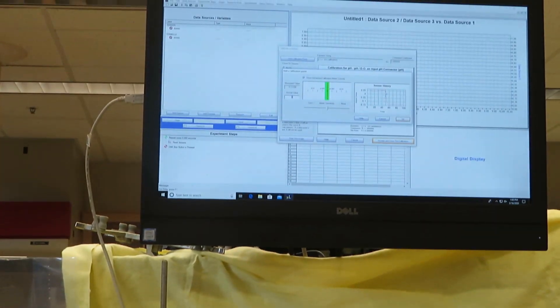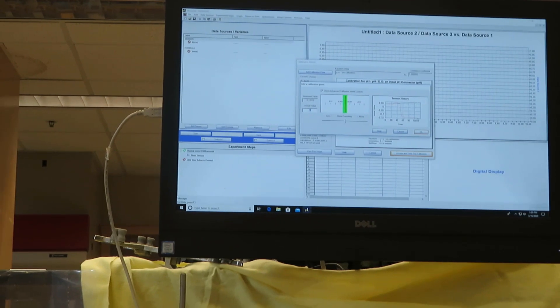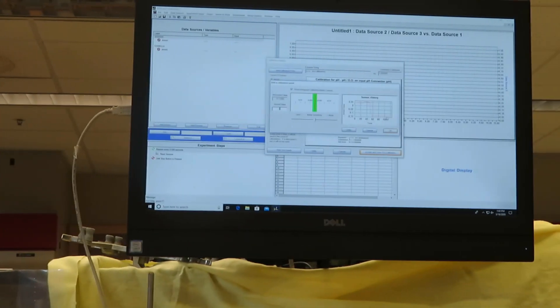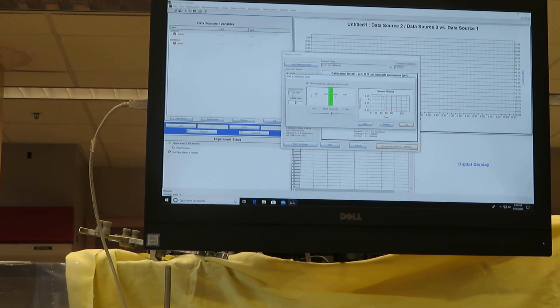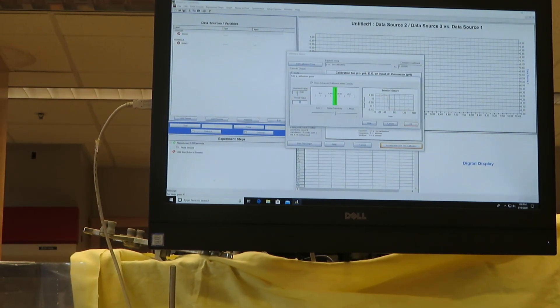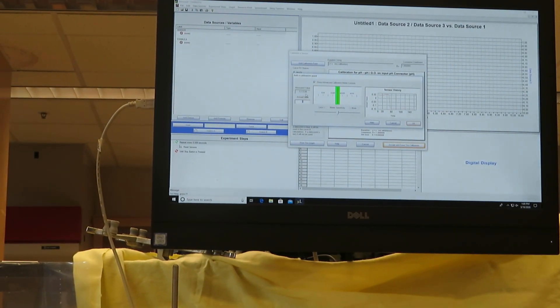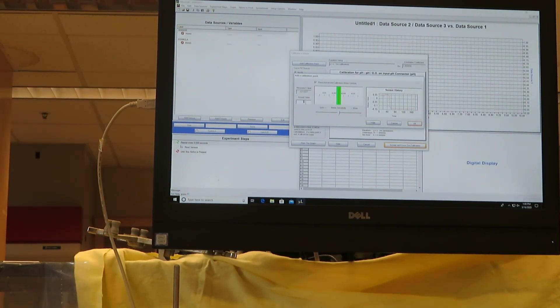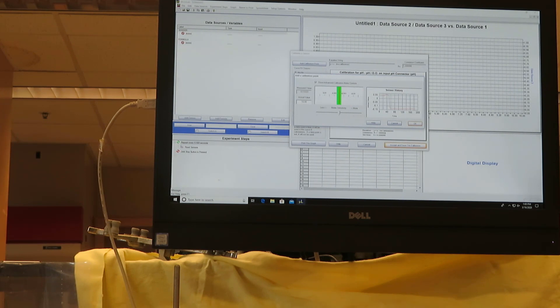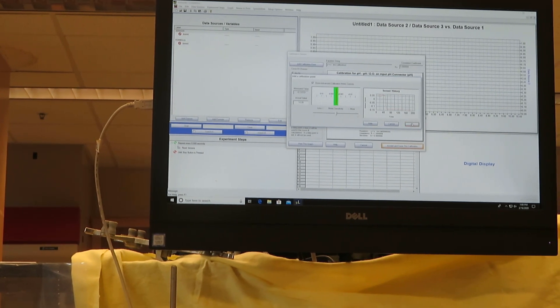Once again, the reading has changed dramatically because we're in a new solution. You notice that the voltage reading is negative, but it's holding reasonably steady to the 4th or 5th decimal place. So I can add 10.00.